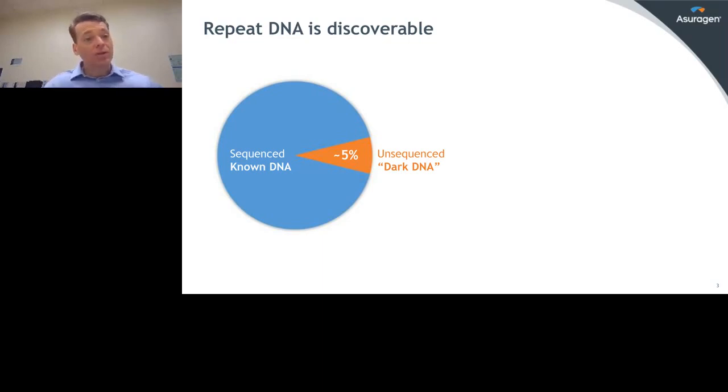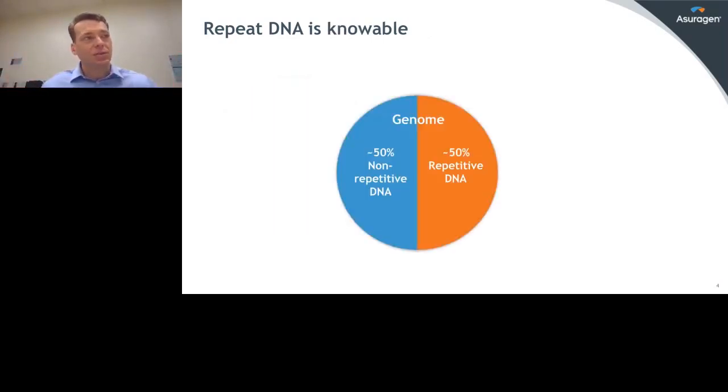But we have an opportunity now with new technology to shine a light on this dark DNA and to understand the specific nature of this sequence. Because we have long read NGS that's now available that can read through these repeat elements and the flanking segments to be able to contextualize repeats. And we have fit-for-purpose bioinformatic analyses that can address some of the special challenges of repeat DNA to be able to define the sequence. It's not a surprise that this remaining recalcitrant dark DNA is repetitive in nature, because in fact, half of our genome is comprised of repetitive DNA.